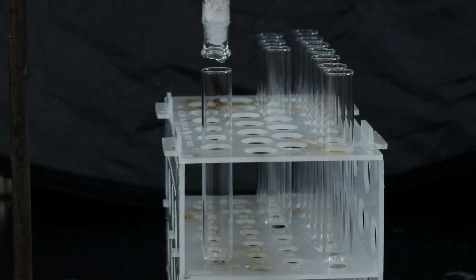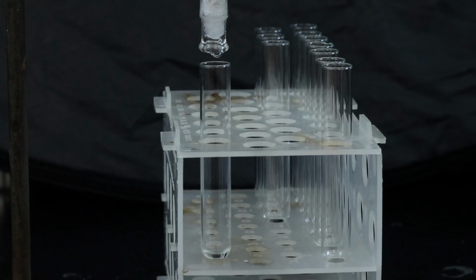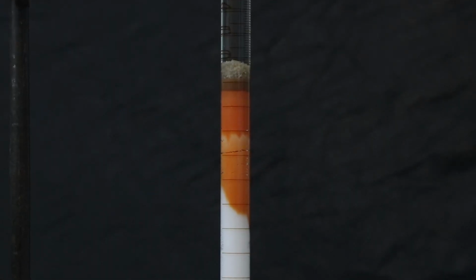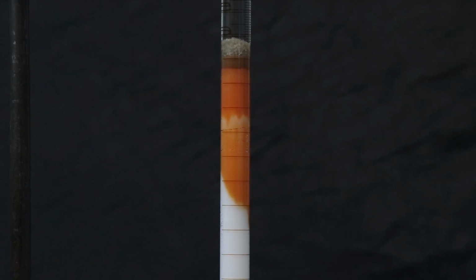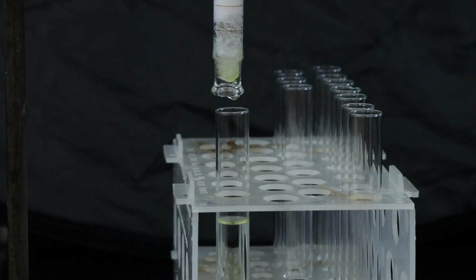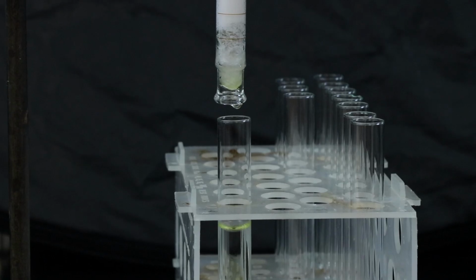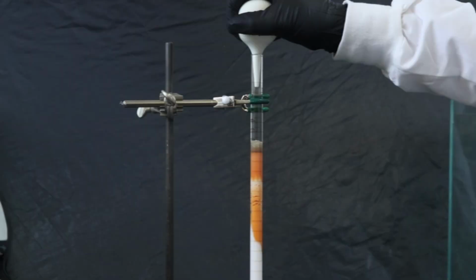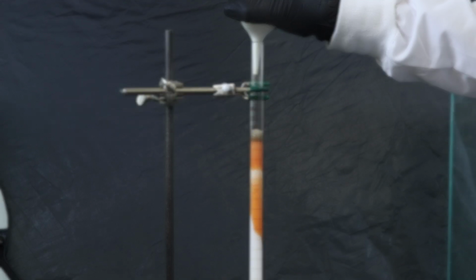At this point, solvent is starting to come out of the column, so I'll gather that in these test tubes. And keep pushing the solvent through until we see a clear separation between the two products. After a little bit, you can now see the yellowish ferrocene starting to come out of the column. And the two products are getting closer to being separated enough where we could move on to the third solvent.